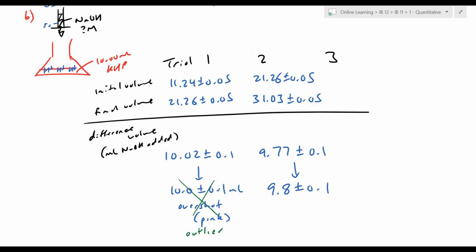At this point here, we were mentioning I actually do have enough. It's only going to take another 10. I have some 20 mils still left in the burette. But what I did is I tried to refill it. At first, I refilled too much. I can even pull out a new fresh burette here. That's totally okay. As long as you're not mid-titration, you can refill the burette all you want. When I refilled it, that's why my starting number is a little bit different. 22.82, that's what my burette said. As I got really, really precise close to the endpoint, this last number here was 32.62 plus or minus 0.05.